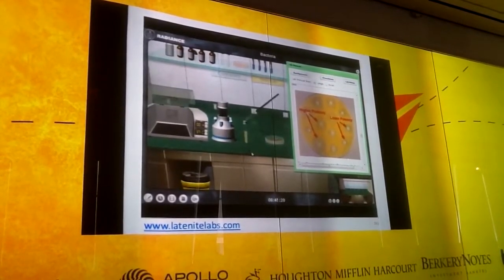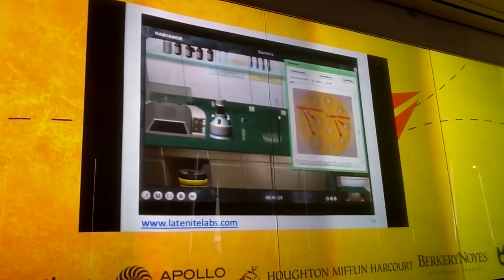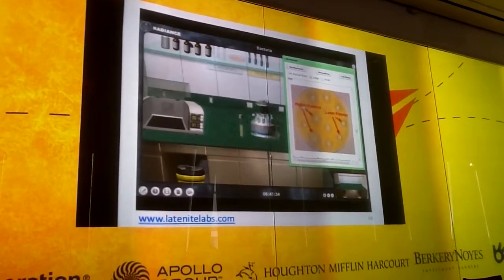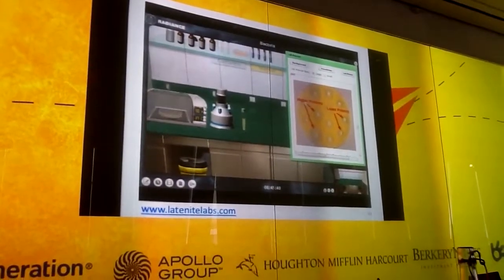If you take a look, the bacteria that we're using in this lab is E. coli. I'm not sure how many people are following what's going on in the UK, but needless to say, a first-year community college student is not going to have a chance to play with E. coli in his lab assignment. We've also got all different types of antibiotics that we can throw in. Here we've got erythromycin, penicillin, and of course we've got the ability to then use an incubator.